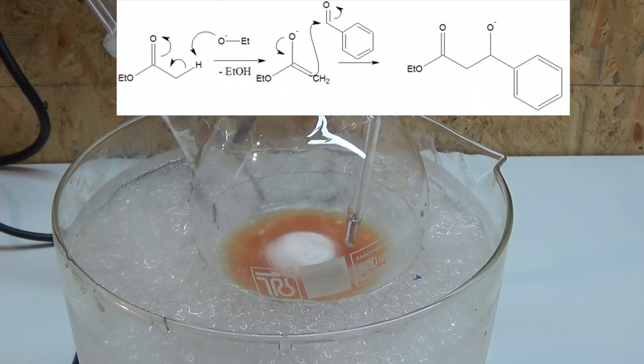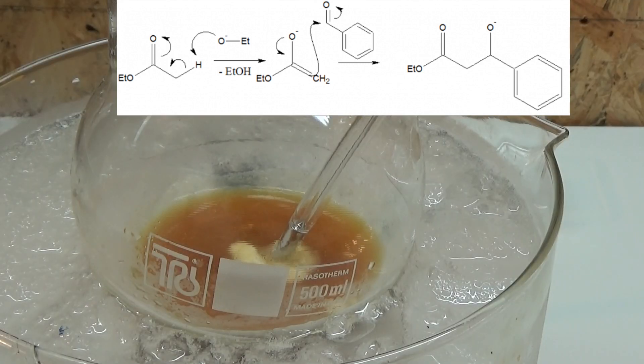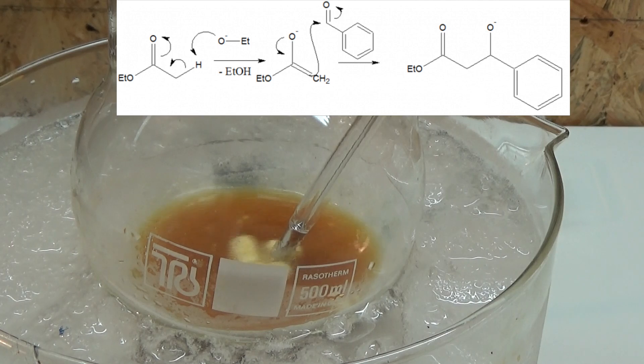Over the span of the reaction the mixture darkens in an orange-reddish way. This is due to side reactions because our intermediate ethyl ester of the desired cinnamic acid is a colorless liquid.